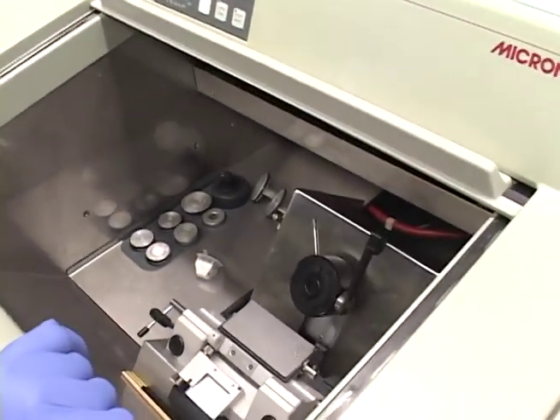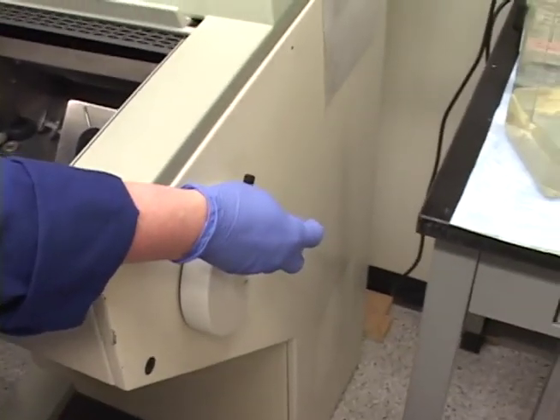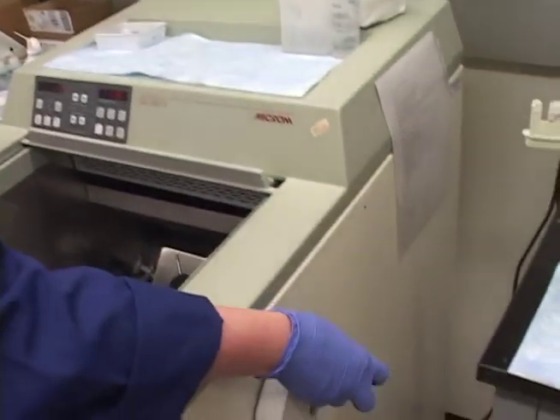Now we're going to get started microtoming. Over here, this is what we call the flywheel. Our cryostat is actually the HM505E Microm. This is our flywheel.